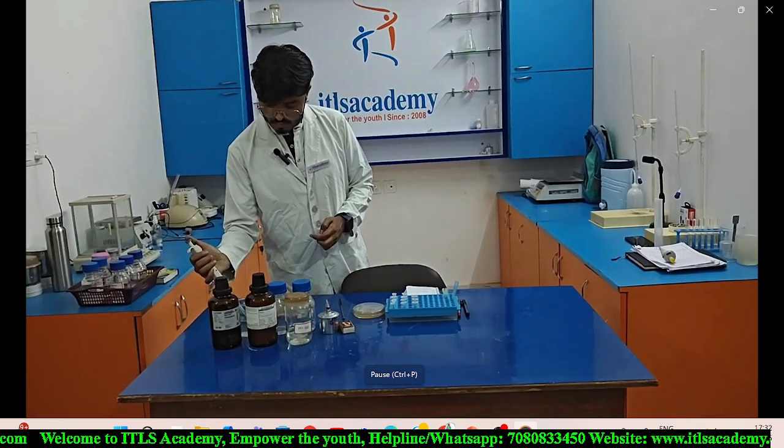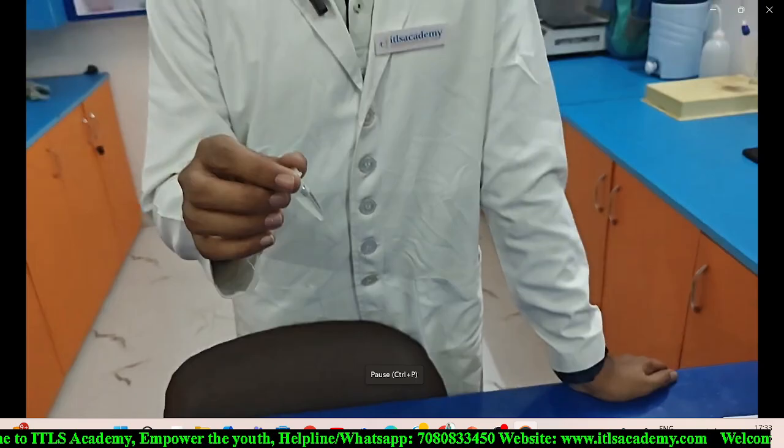And we need to fill all the 12 Eppendorf with the same amount of distilled water. Here we have already filled each Eppendorf with 1 milliliter of distilled water, and as you can see I already marked all the Eppendorf with B.